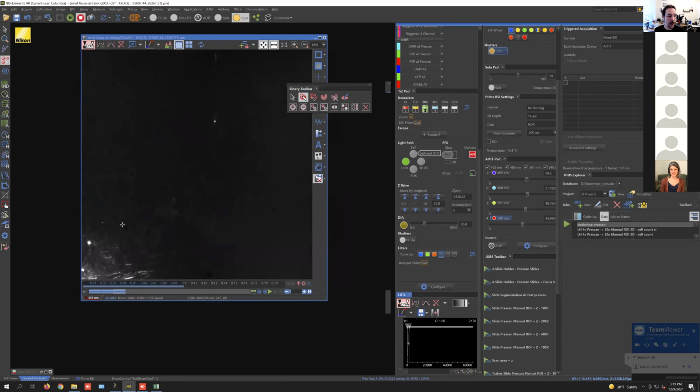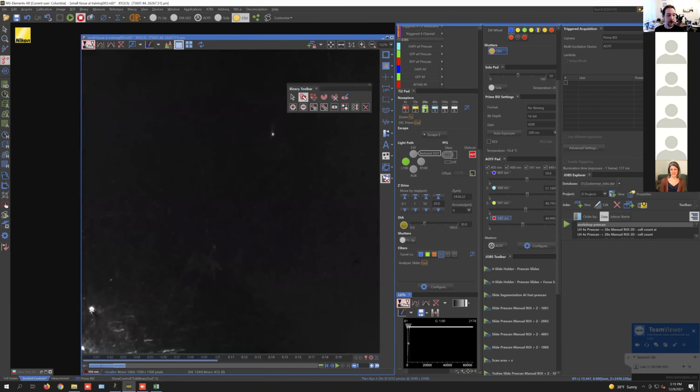Okay, here we have at least one cell. If there were no cells here, what you could do, and this is what I've done in the past, is paste some cells into the image, sort of artificially adding cells, so that it knows this is what I want versus all this other stuff which I should ignore. That's one way you can get around this problem. But just remember, if you have an image in this series that doesn't have a mask on it, then it won't run the network and it won't train the network.